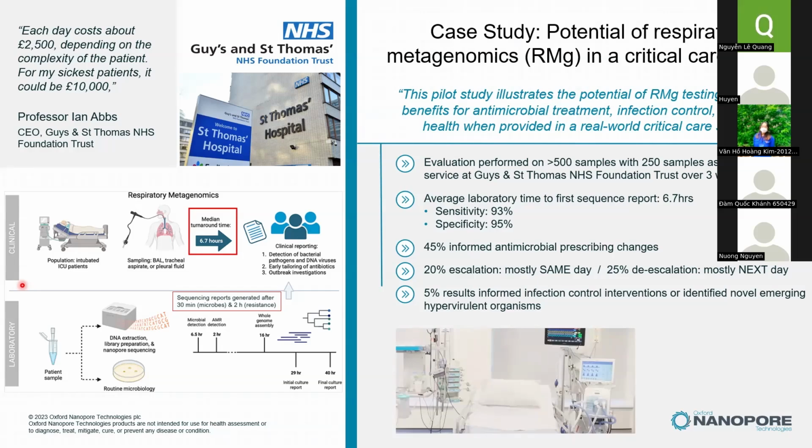I mean, if I use a kit for selection of the fragment DNA, should I use TapeStation for QC of my sample again? Yeah, sure.